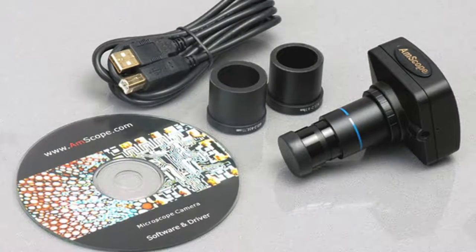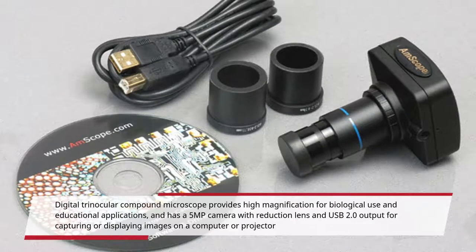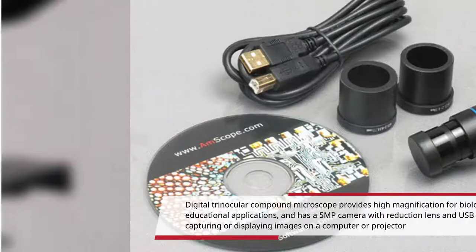The Digital Trinocular Compound Microscope provides high magnification for biological use and educational applications, and has a 5MP camera with Reduction Lens and USB 2.0 output for capturing or displaying images on a computer or projector.